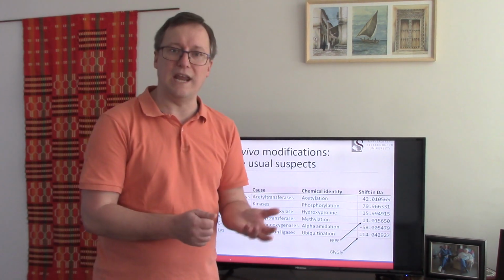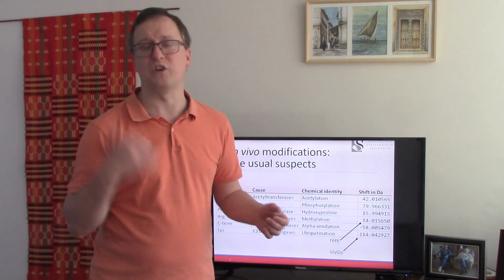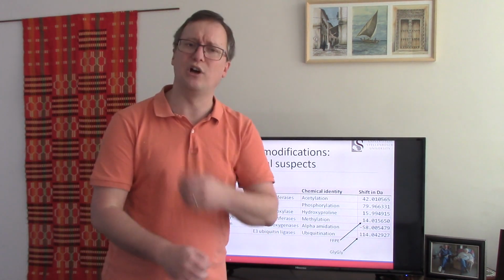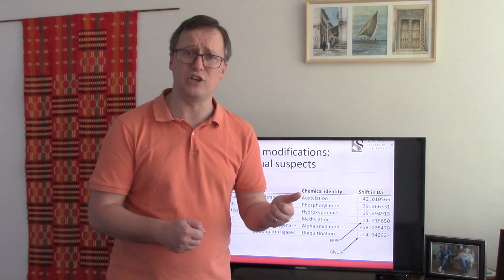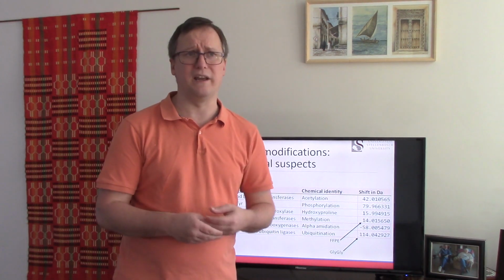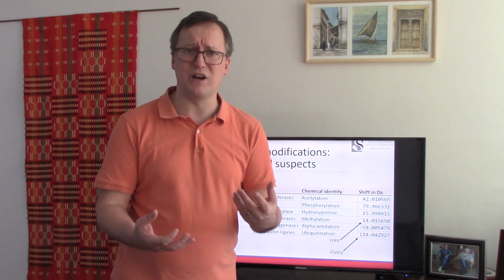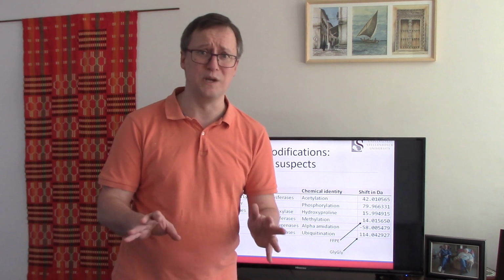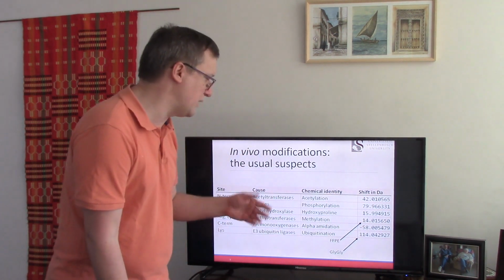This acetylation can be taking place on N-termini, of course, especially on protein N-termini after lopping off the initial methionine, but it may also be found on lysine side chains. Certainly when we do stuff like examine the histone code, the way that lysine and arginine can be modified in that context is extreme. So being able to look for acetylation at 42 mass units is quite important.